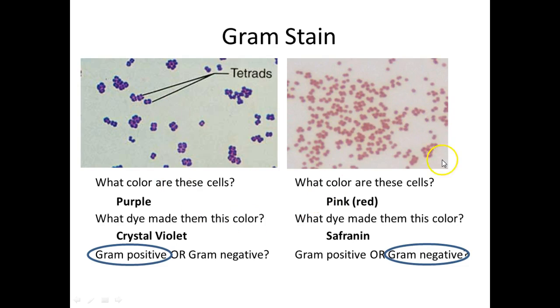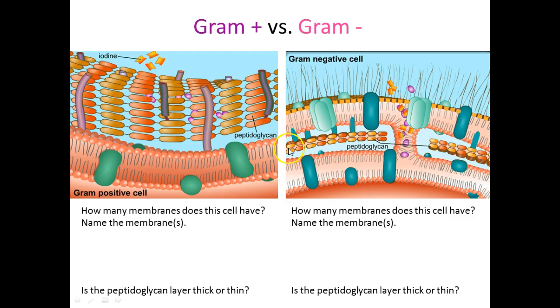Here, what are you seeing mostly? I see some clustering, I see some tetrads, right? But I see more pairs. Don't you see that? Pair, pair. So that would probably be diplo. Right? If it was clustered, you'd see more than just one cluster. If it was tetrad, you'd see more than one, right? I see one here, maybe two there. Mostly I'm seeing pairs. You see that? So that's how you would determine arrangement for that one.